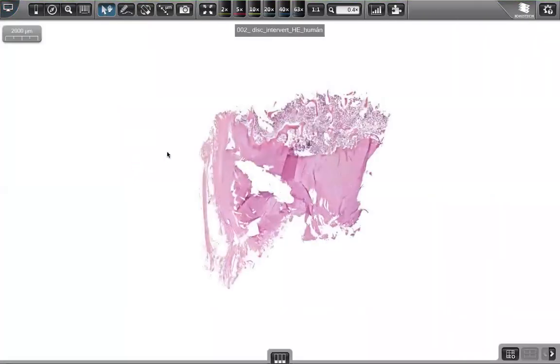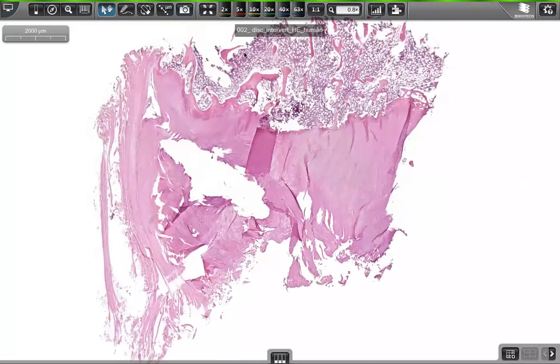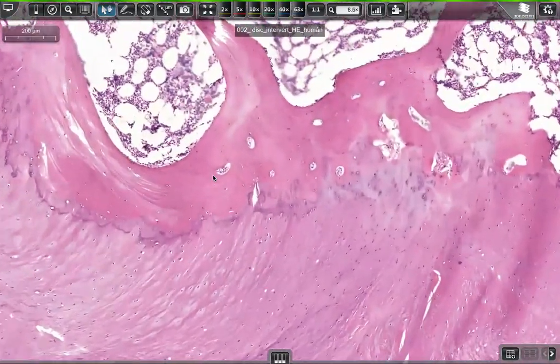Start with this. So this is the intervertebral disc, you remember, which eventually shows a bony part. There's a spongy part of the bone having red bone marrow. This is a slide to show the exact sources of the platelets, the megakaryocytes, but also we can find some components of the intervertebral disc. So when we are looking at that area here, that is a really nice one.